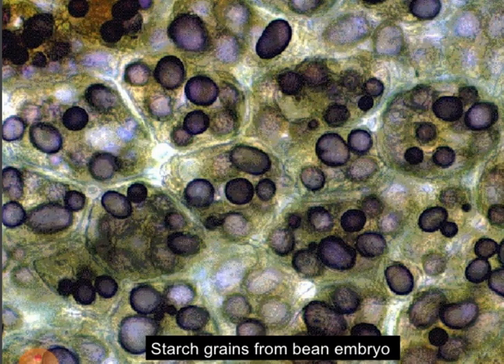Now, starch grains appear this way when they are stained with iodine. Grains of starch, when stained in iodine, this is the way they look.